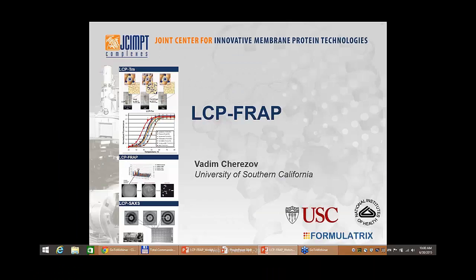Thank you. Hello everyone. My name is Vadim Cherezov. I'm a professor at the University of Southern California. And in today's webinar I will be giving you the bolts and nuts of using the LCP FRAP assay for screening membrane protein crystallization in lipidic cubic phase.